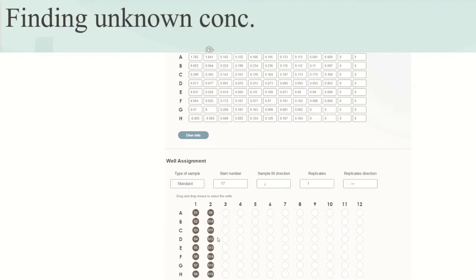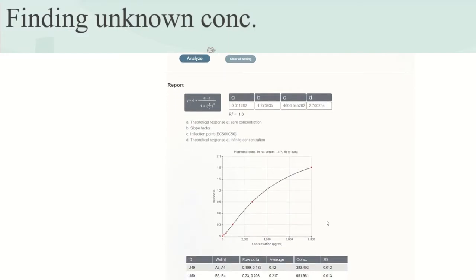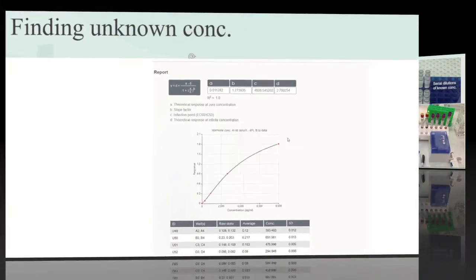You just simply enter your concentrations for your unknowns, your concentrations for your standard curve, and it's going to allow you to determine what the concentrations of your unknowns are. So if you're interested in something like that, let's get into this video.